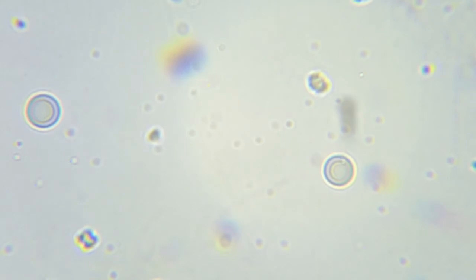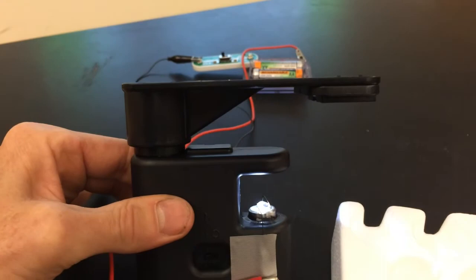Well, I'm going to quickly zoom out and show you what you can do with this microscope, of course, is, since it's so small, it's pretty trivial just to go ahead and tilt it back and forth.